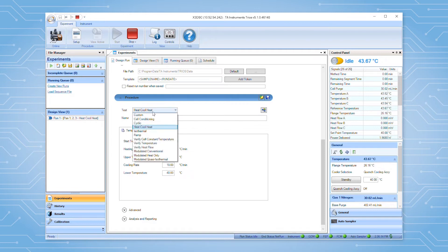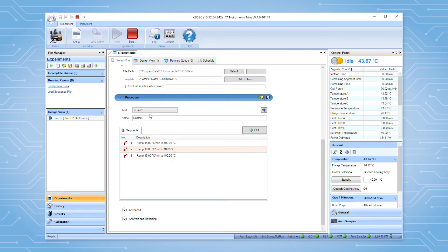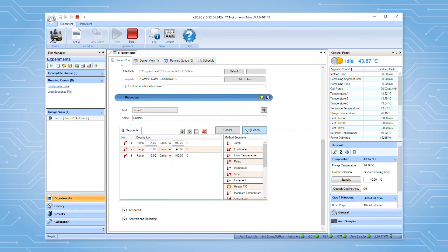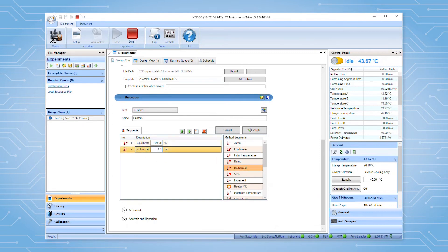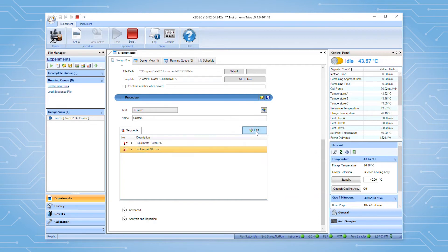Select the custom option from the list to build an experiment from scratch. Click the edit button, then add the required method segments by double clicking or dragging them into the segment editor. Once complete, click the apply button. If desired, procedures can be saved for use in future tests.